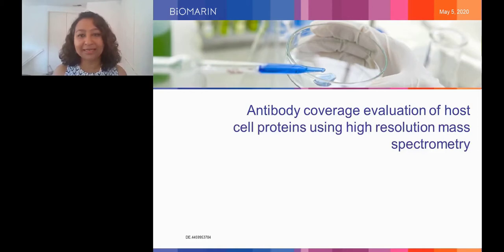So we're blinded to the other half, and that's not a very good analytical method. It's nice to have something above, I would say, about 70%, and the higher the better, because this is ensuring that the antibodies that we use are highly sensitive and selective for the impurities that we're trying to make sure are controlled and monitored.